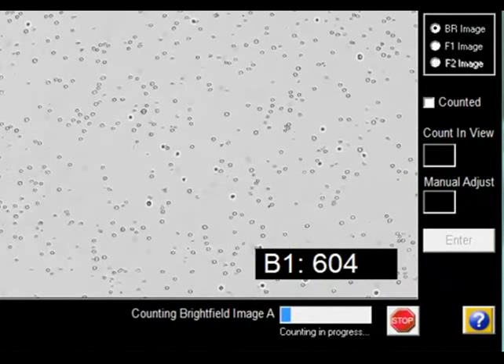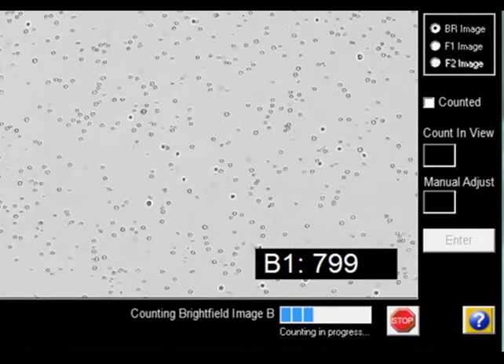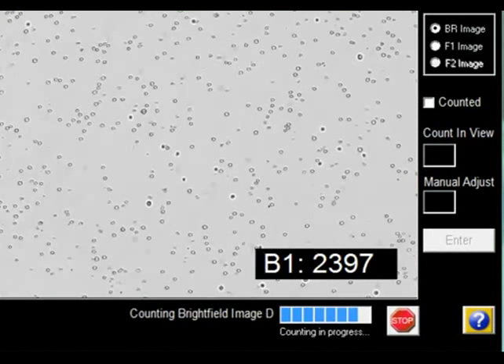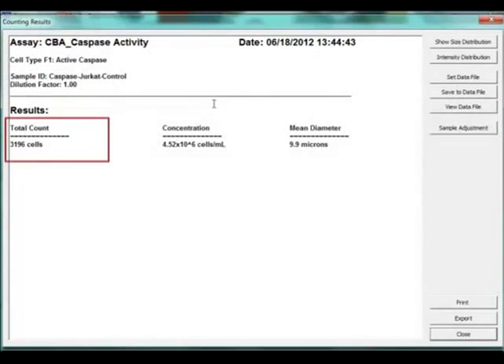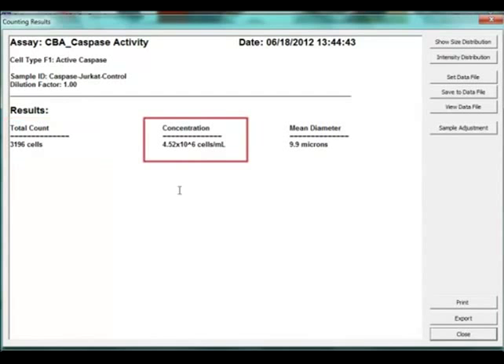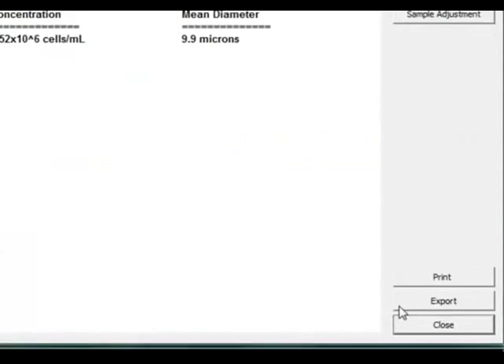Cell images are captured and analyzed based on preset parameters for the caspase-8 assay. A report showing the total cell count, concentration, and mean diameter is automatically displayed.